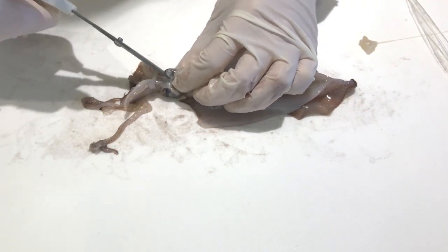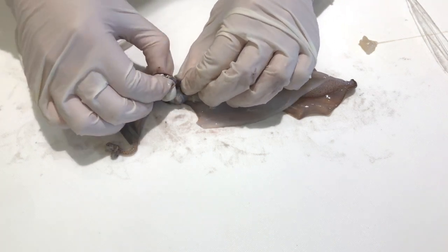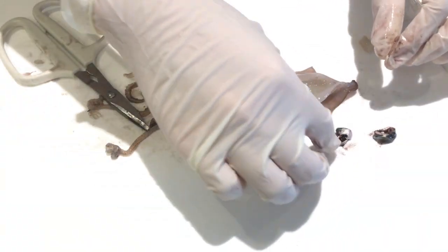Next, I will remove the squid's eyes. There are two eyes, and I cut right in the center of each of them and removed them one by one. I then took out the lens from each eye, which are those super tiny transparent spheres.